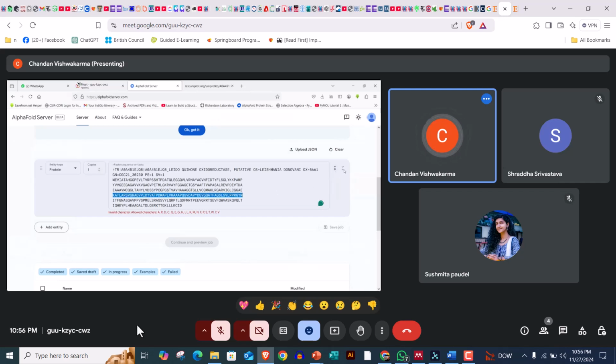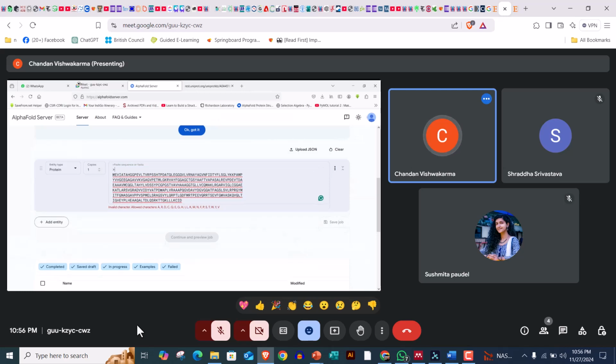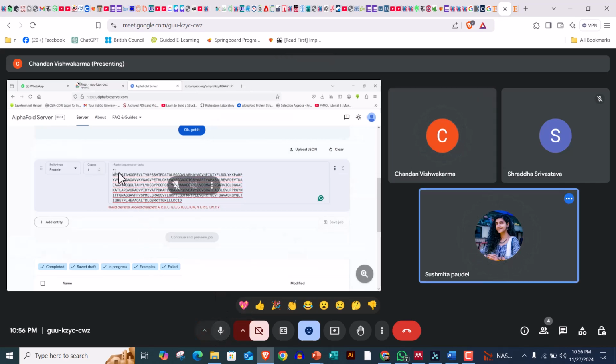Okay, it's not taken. This one is not required. Actually, this is not taken. Your greater than sign is there.